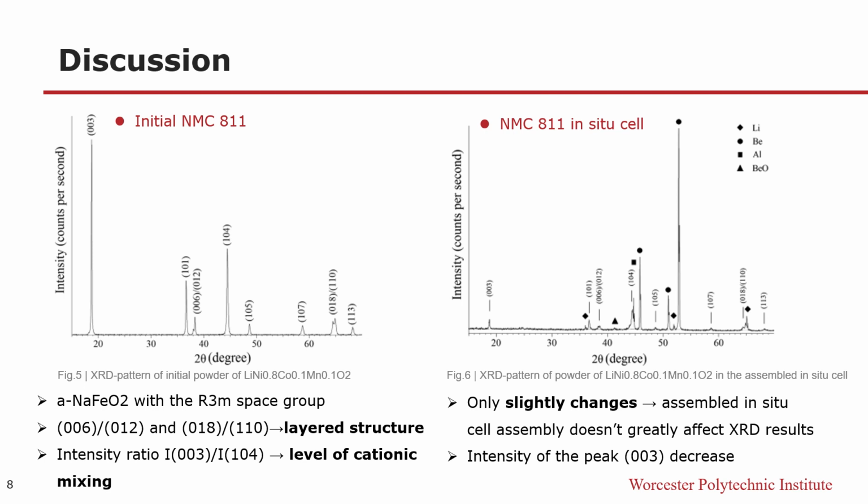Regarding the lattice parameters, a slight change in the in-situ assembly compared to the initial powder was observed. The noticeable decrease in the intensity of the 003 peak relative to the others can be explained by the influence of the irradiation angle on the depth of X-ray penetration.